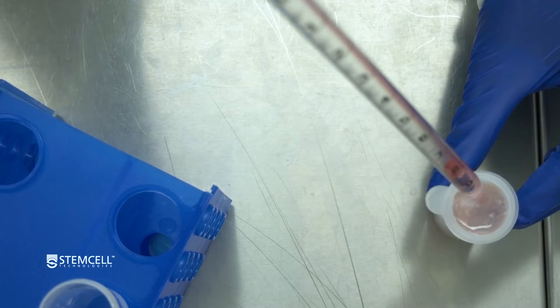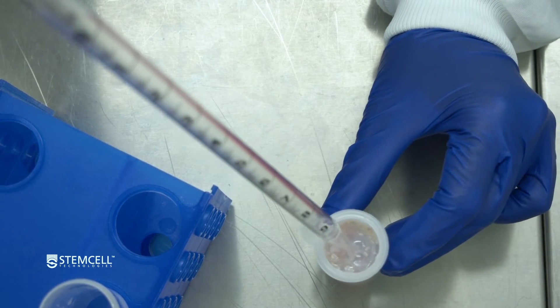If the filter becomes clogged, transfer the contents to a new, pre-wetted filter.